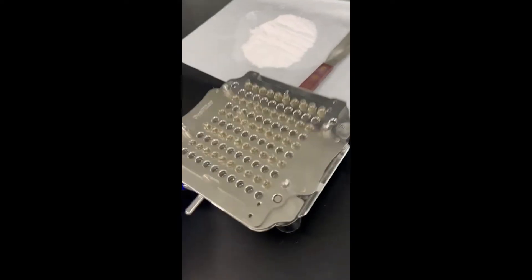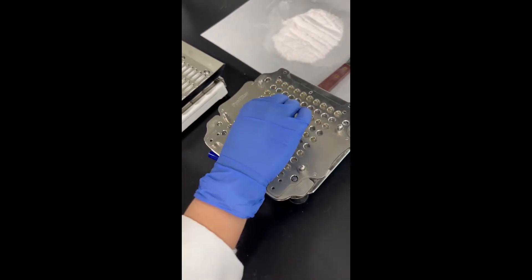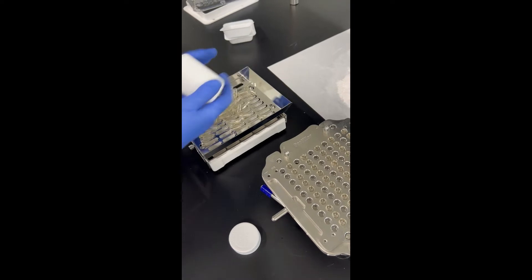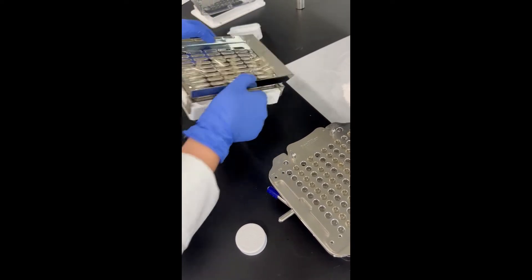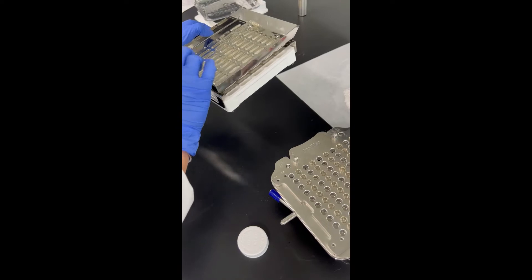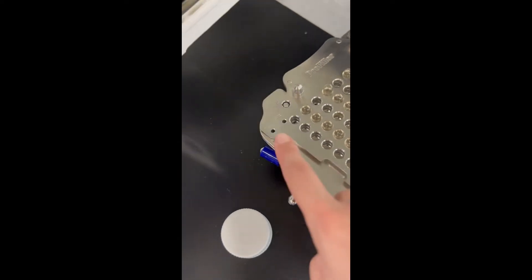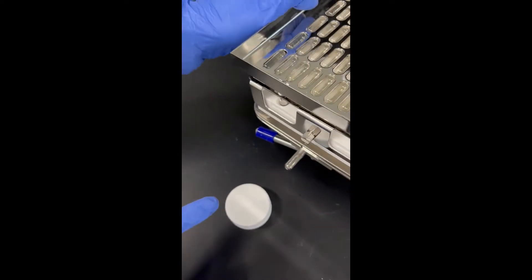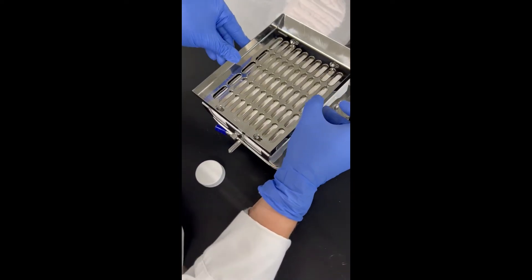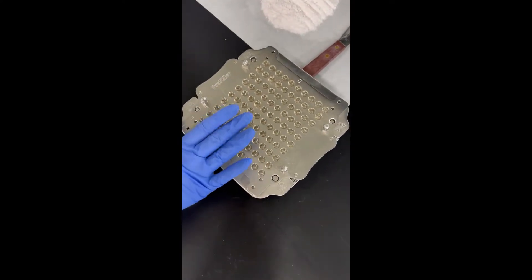Then you'll just take this top part off, and if any capsules are not in all the way you can just push them down. Go ahead and do this again — put it at position one, follow the arrow, they all fall in, take off the top piece. All of your holes are filled now, so you can set that filler to the side and push them all down to make sure they're in there.